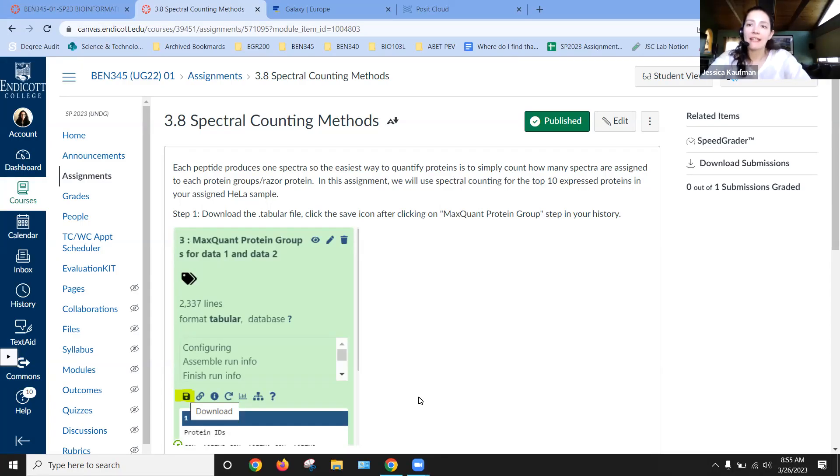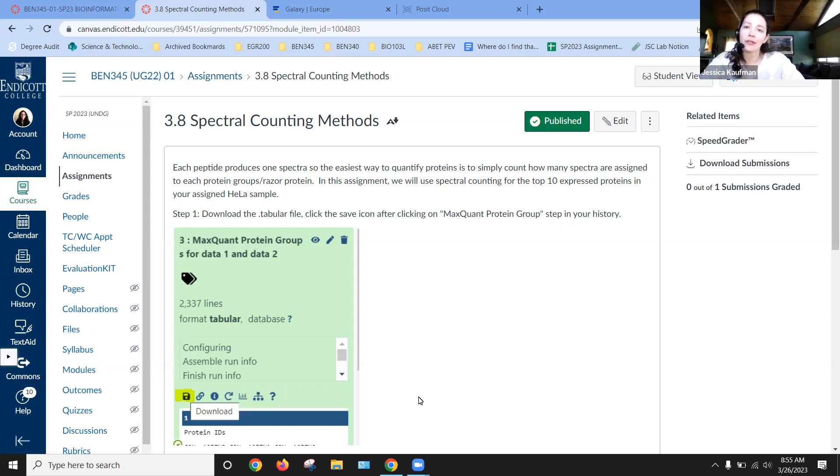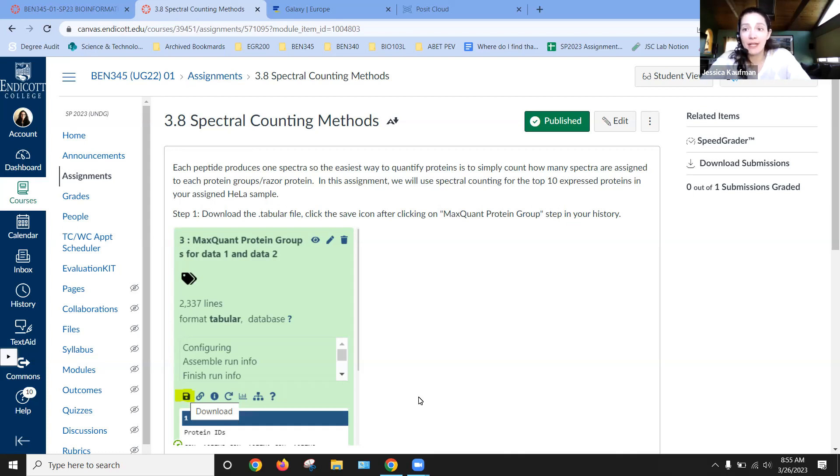Now we're going to look at the other result of MaxQuant. So we've looked at the PTXQC report, we've looked at the peptide assignments, now we're going to look at the protein group assignments. One of the first things you should notice is that there are many more peptide lines than protein lines, and this makes sense because several peptides will map to each protein.